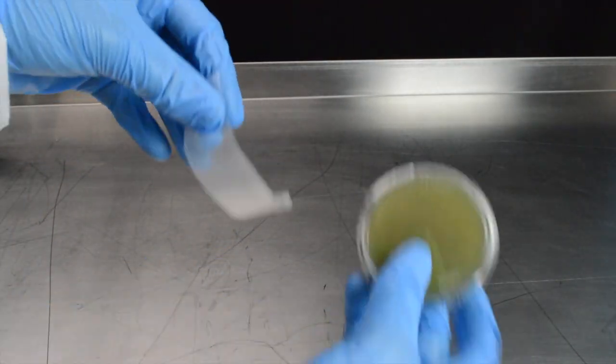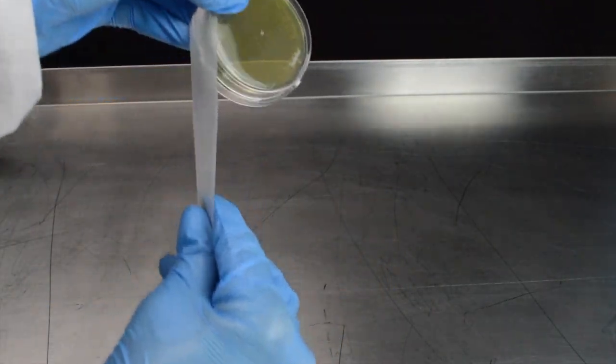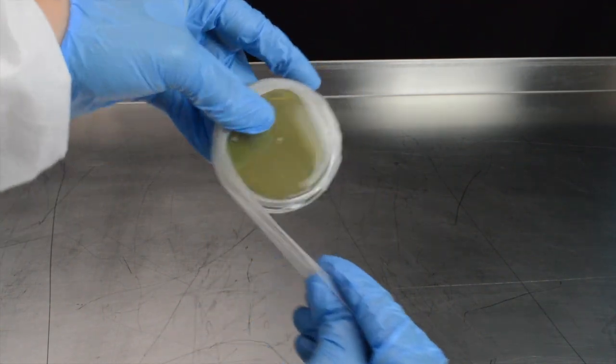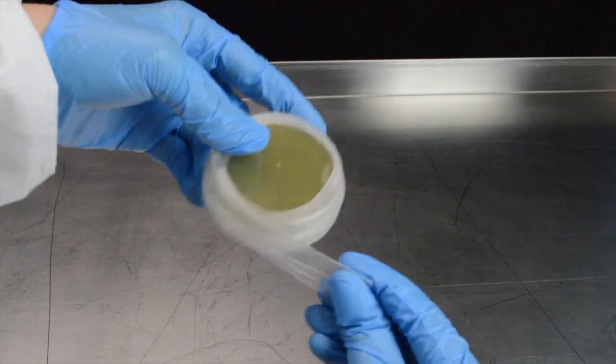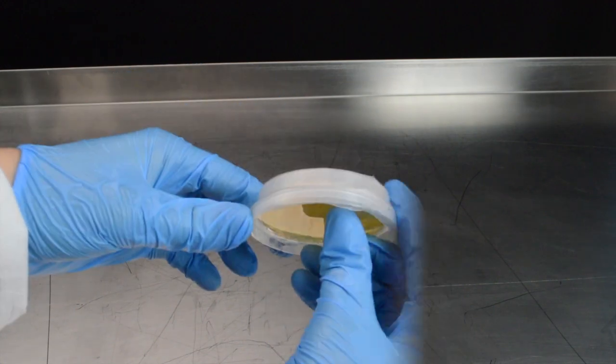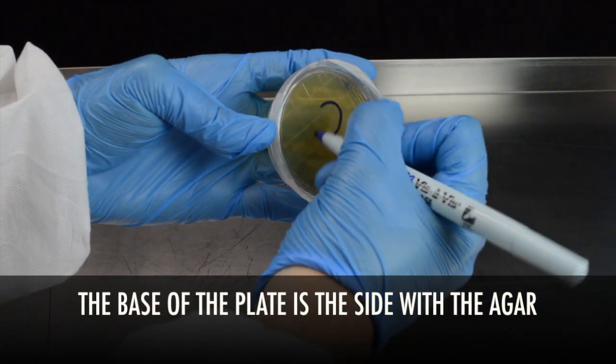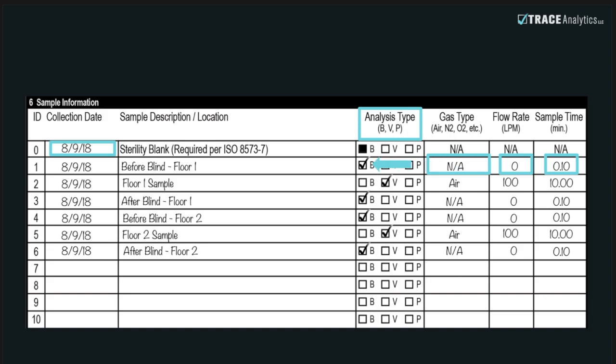Remove a single strip of parafilm from its paper backing and stretch it to wrap around the rim of the plate, securing the lid and base together. Use a permanent marker to label the base of the contact plate with the appropriate number from your chain of custody. Fill out the chain of custody to reflect the labeled plate, date sampled, and description.